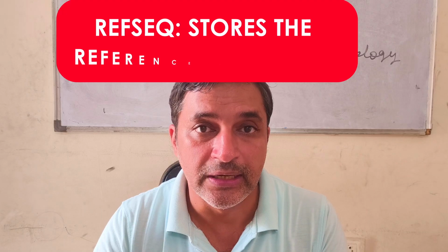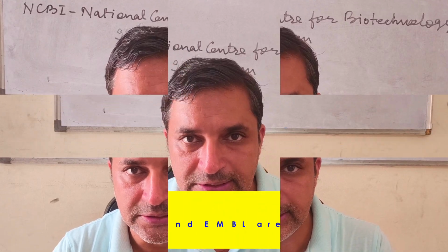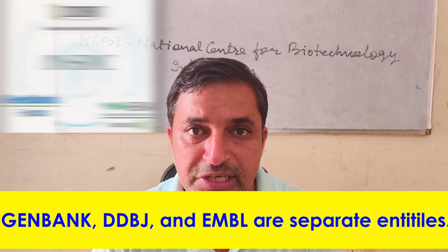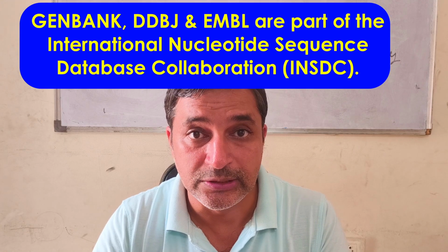The second one is RefSeq, which stores the reference sequences. So it is basically a large pool of reference sequences. The third one is DDBJ or EMBL, which are repositories that contain a globally connected sequence pool.